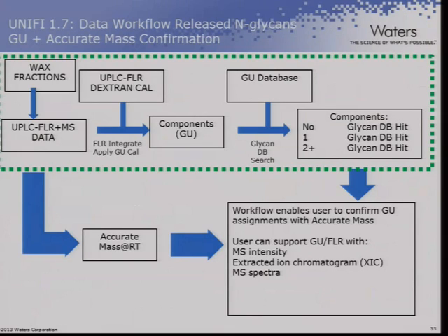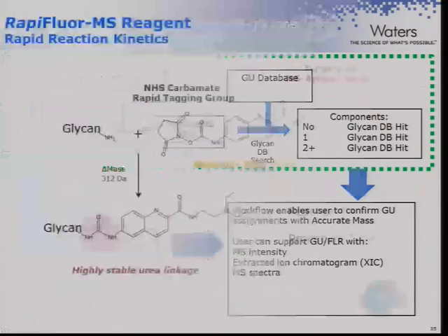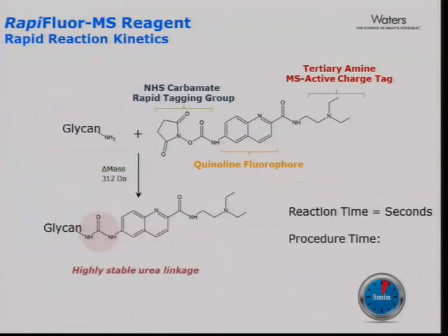Now, you don't have to do it online, and we still don't have it online. We just take the pool of glycans and we do the mass spectrometry on a different instrument, and we use that. So you don't have to have it online. You can do something as simple as having a MALDI, just doing a composition, matching up the compositions. So this is the Rolls Royce, but you can get on quite well with the Mini. There's also a Waters person going to give a talk next, so I think they're going to go into this probably.